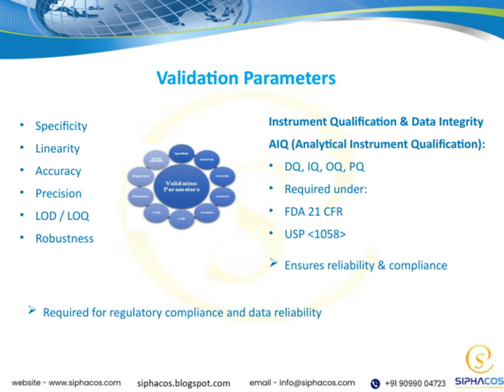Now, these requirements are not just best practices, they're mandated under regulations like FDA 21 CFR and USP 1058. Following these guidelines helps us stay compliant and maintain the integrity of our data. Ensuring data integrity is fundamental because it underpins the trustworthiness of our results.